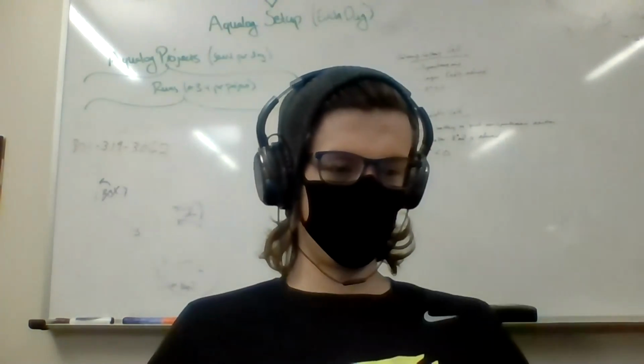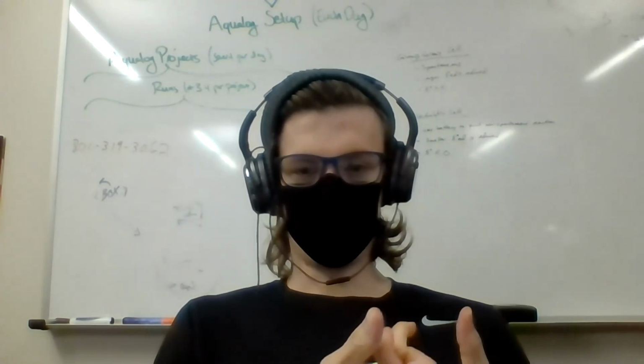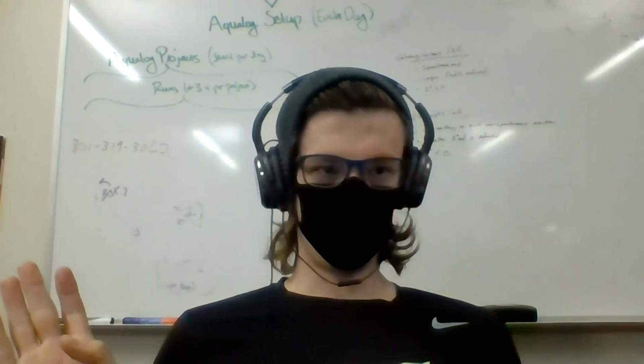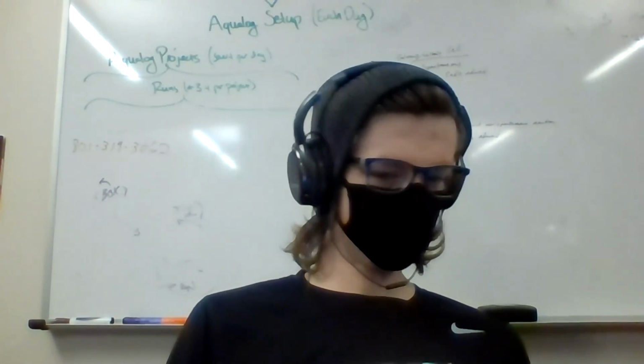are the steps you do once you've stuck the green USB into the USB ports on the scan console, and you've downloaded the data, and you've shut everything down. You go to a computer that has access to Box, and this is what you do. Let's see, I'm going to share my screen.